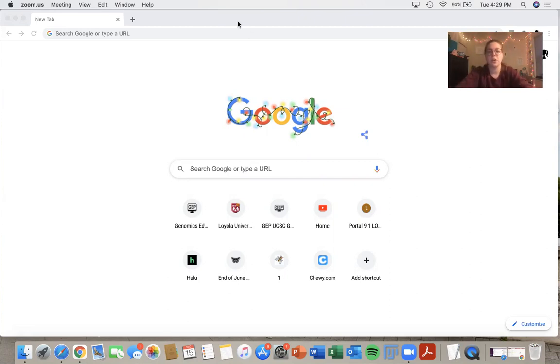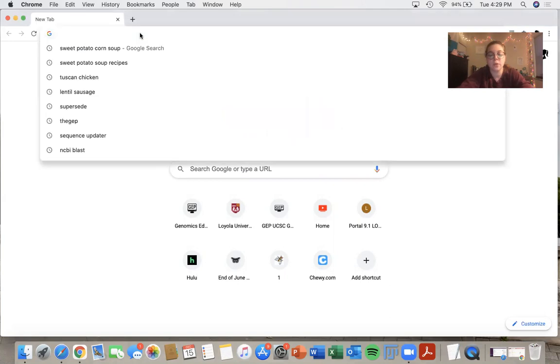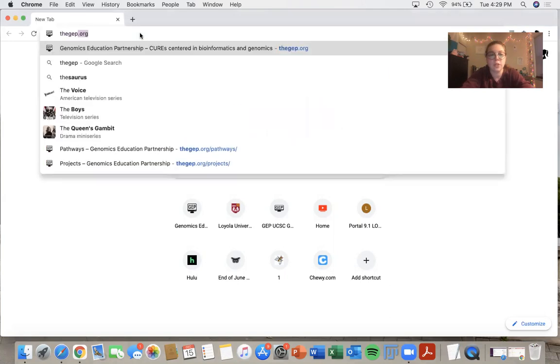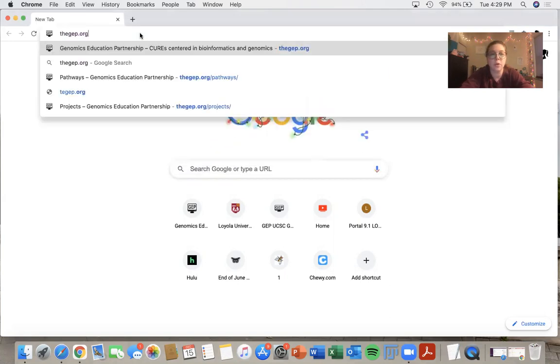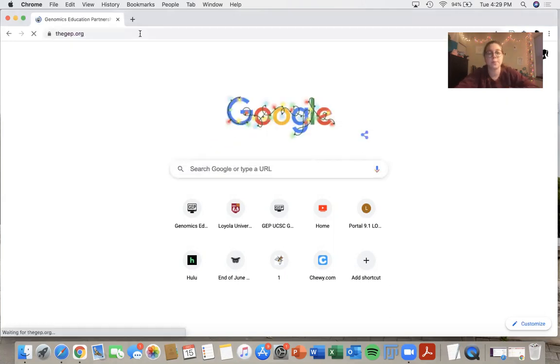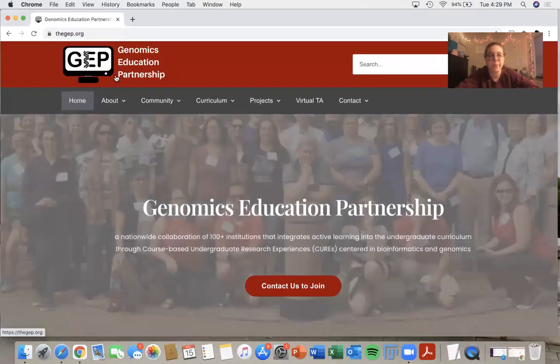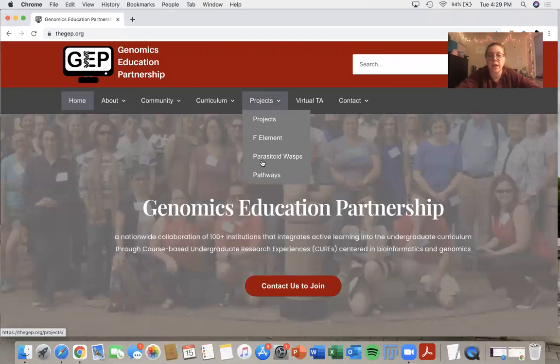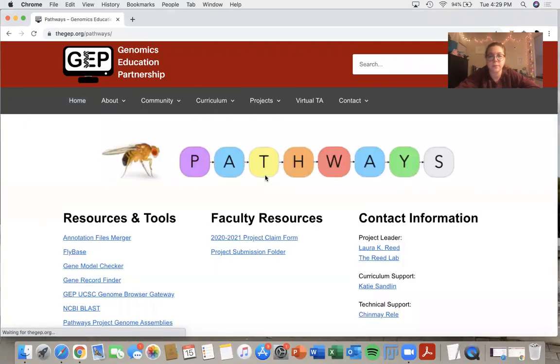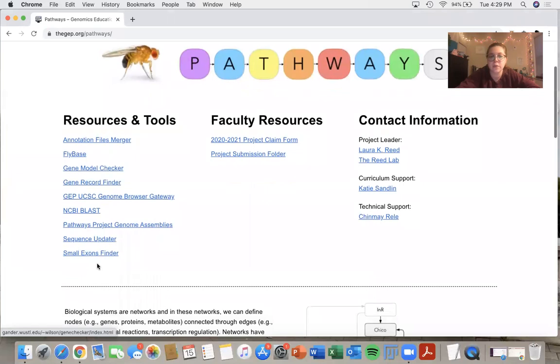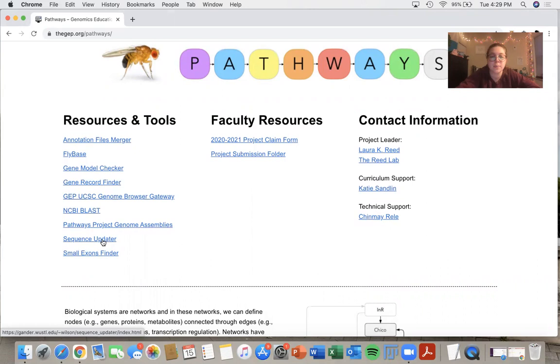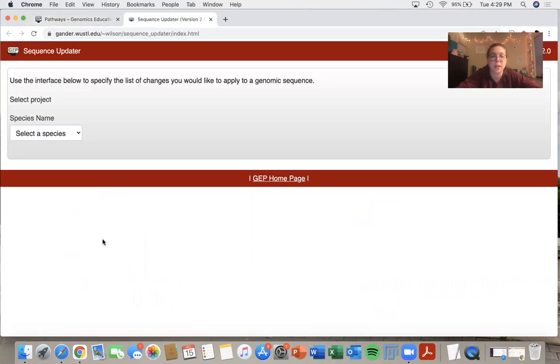So to navigate to the sequence updater, we will go to thegep.org, go under the projects tab and pathways, then we get to our resources over here. The second to last resource is the sequence updater, so we can click that.